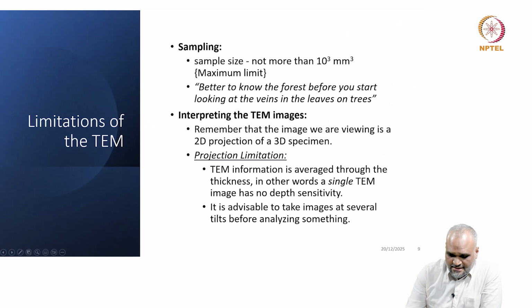So when I have information averaged through the thickness, it is always advisable to take images at several tilts.